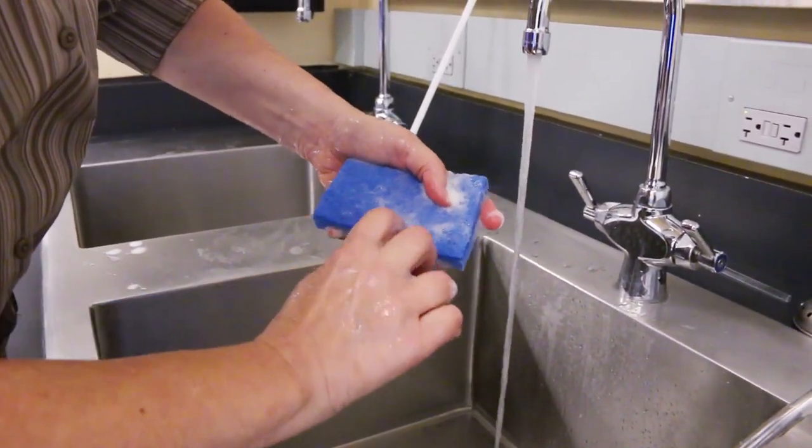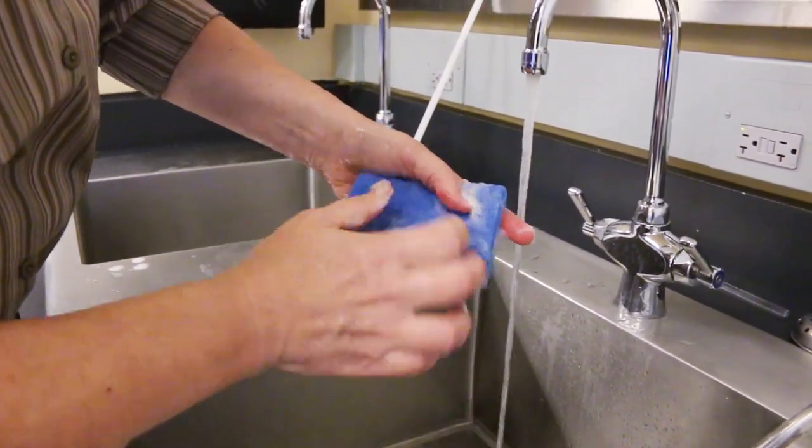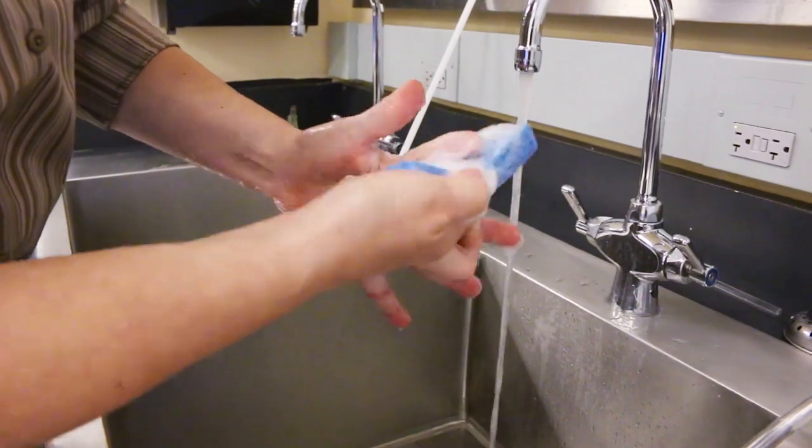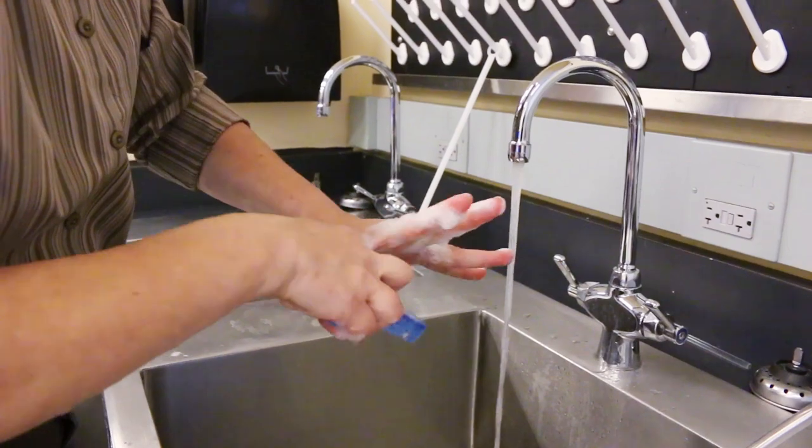Use this sponge to clean each of the four surfaces, top, side, bottom and webbing between your fingers, beginning with the thumb and repeating for each finger on each hand.